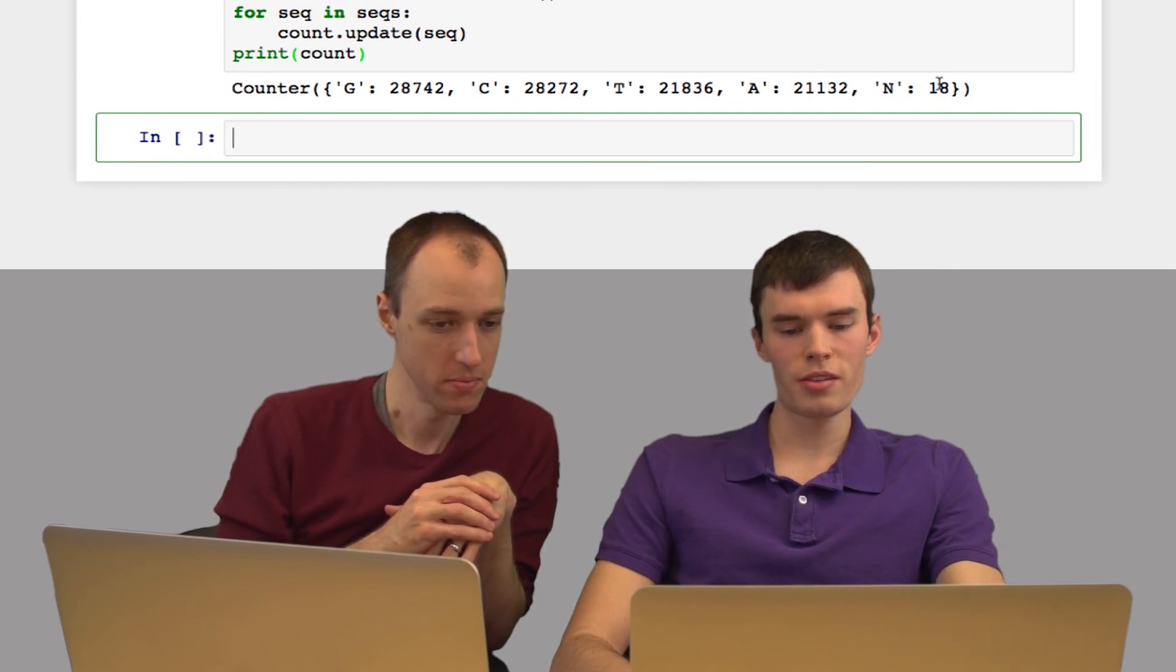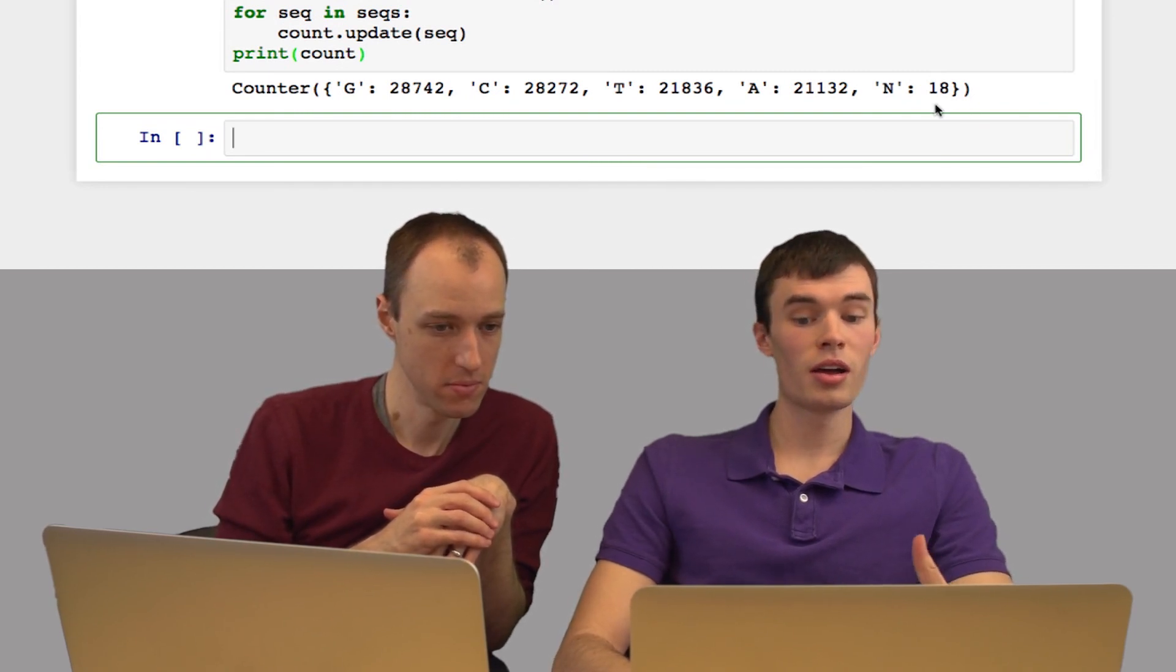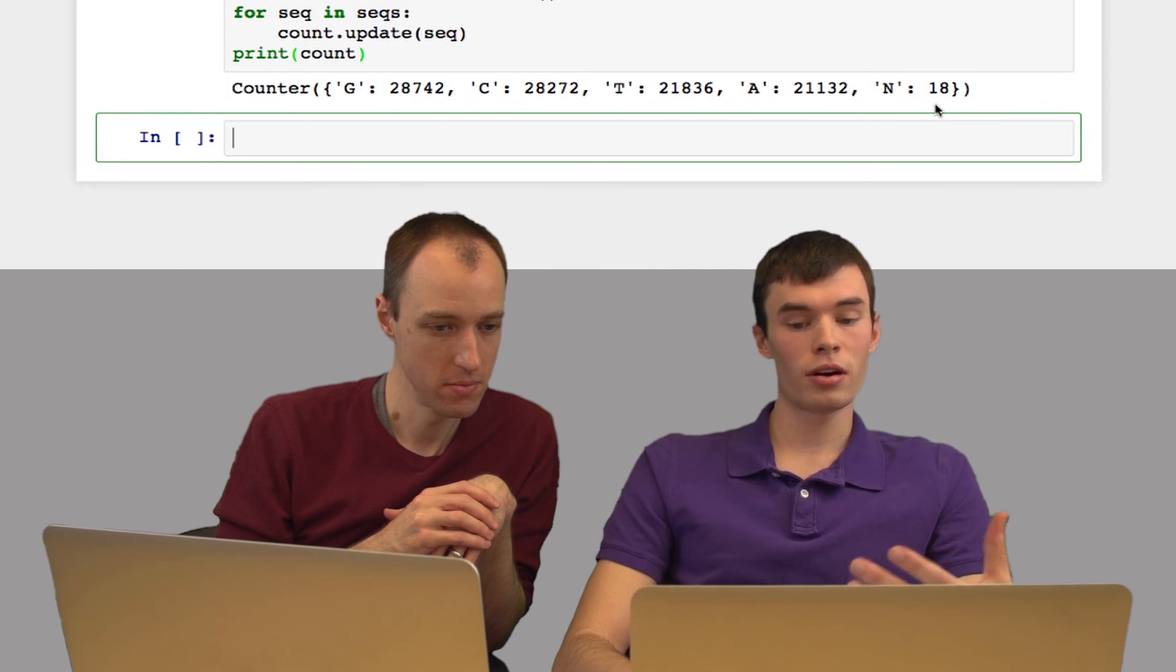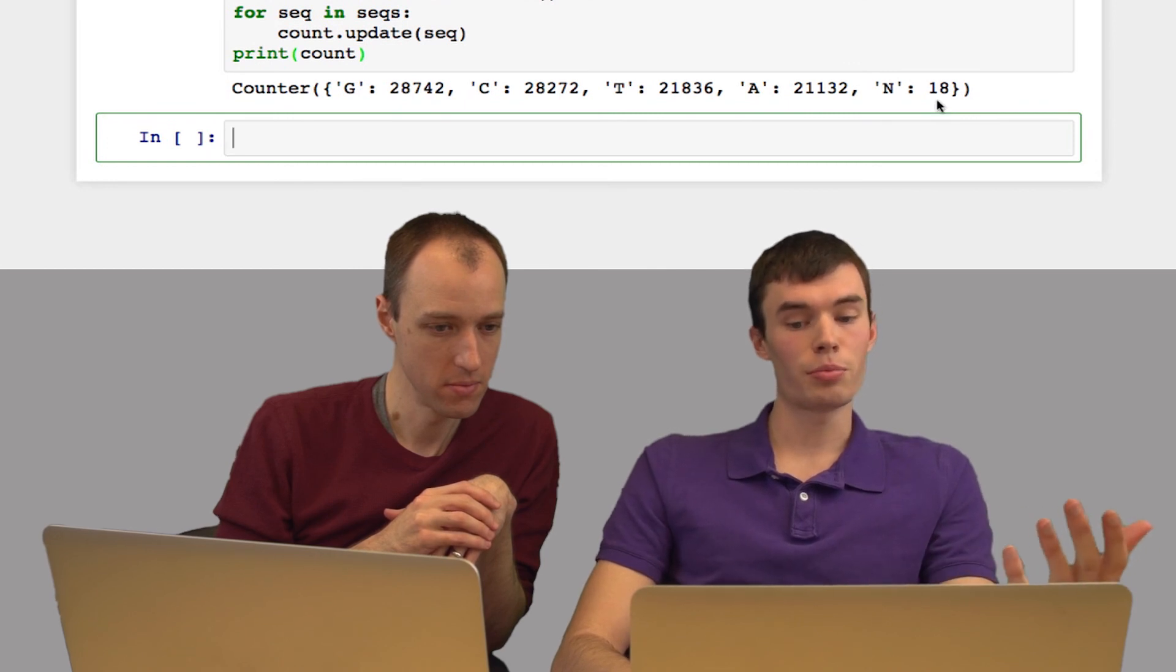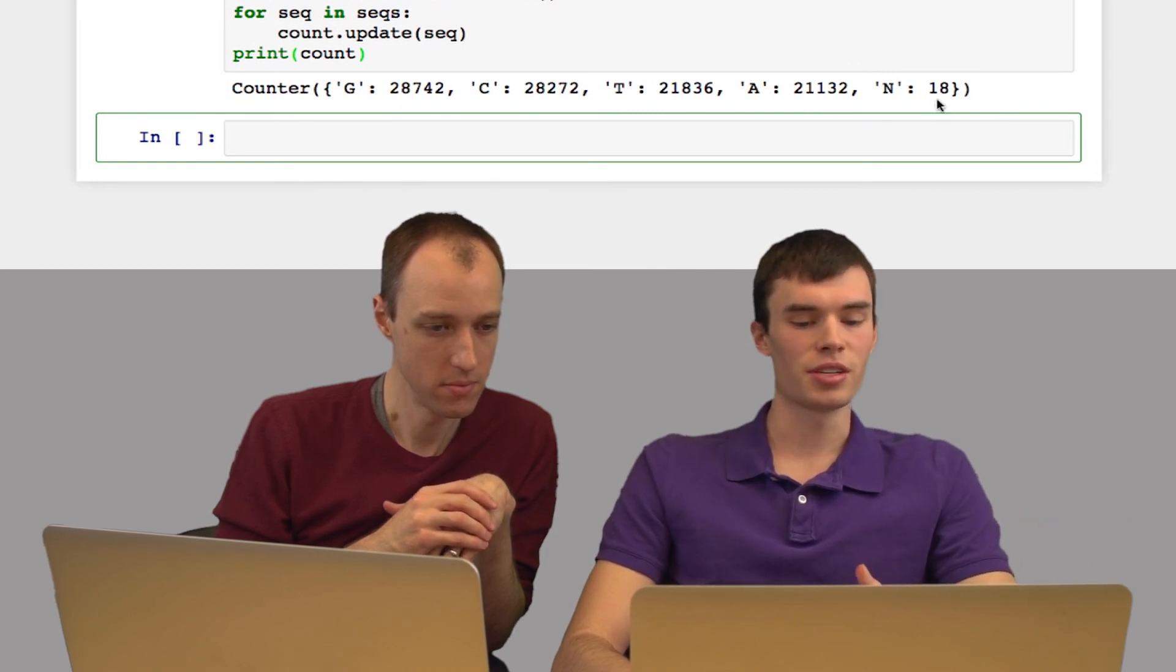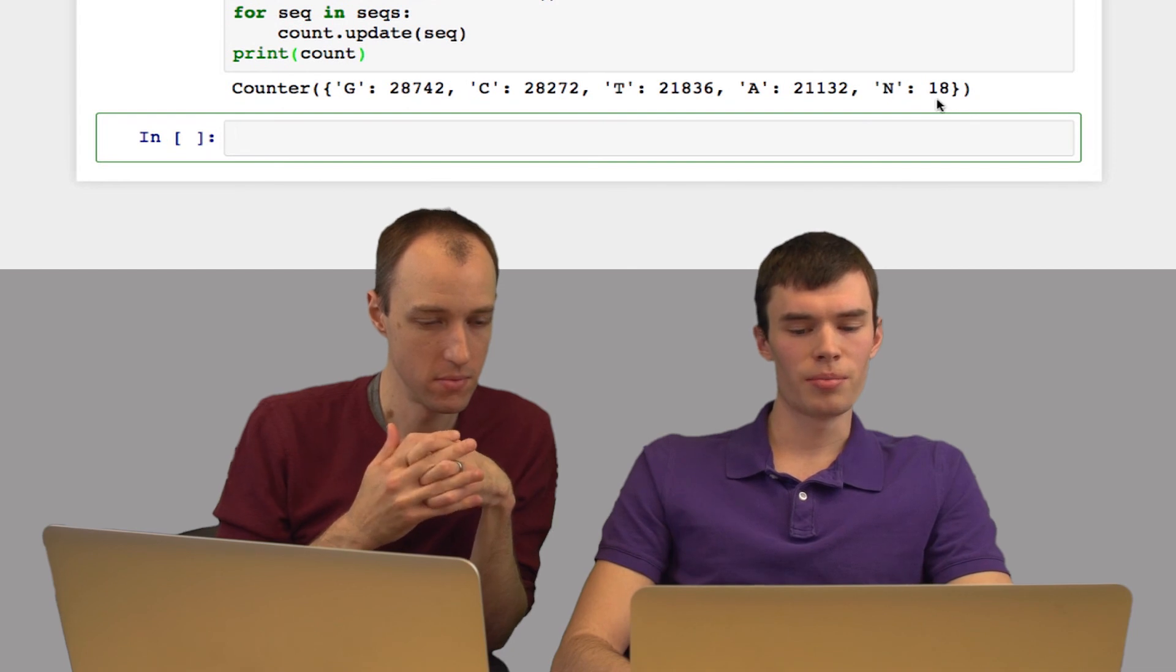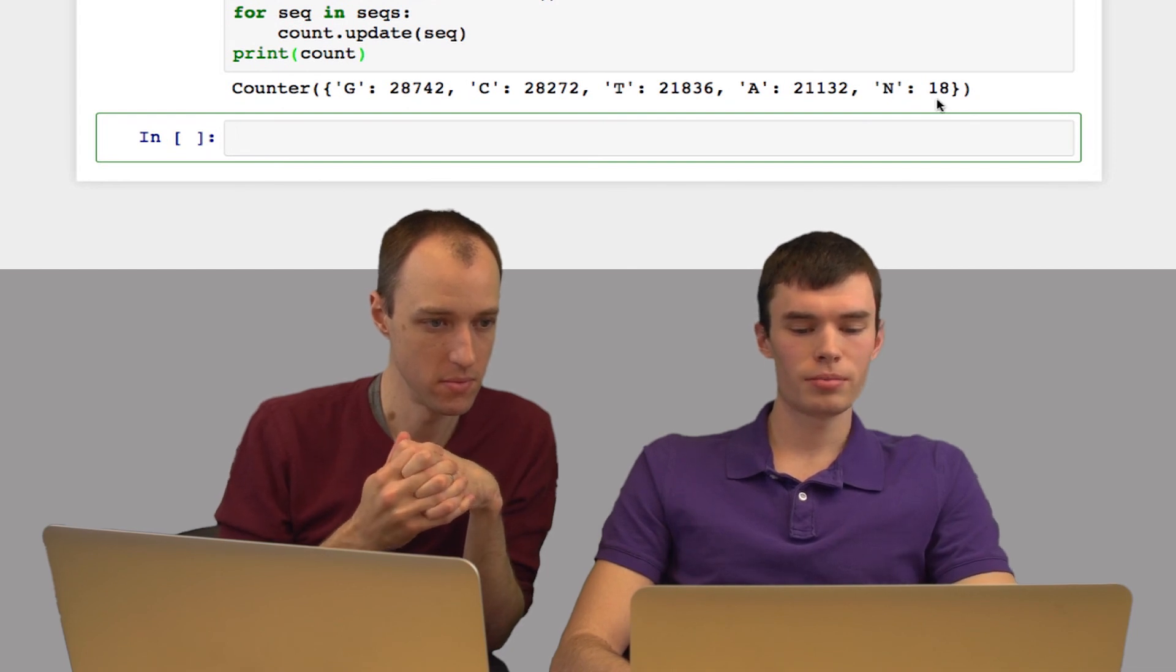Thankfully in this sequencing run, the sequencer only reported N 18 times, which is very little. If you see Ns, that means something's wrong—the sequencer wasn't able to figure out what base was there. So it's good it didn't happen too often here.